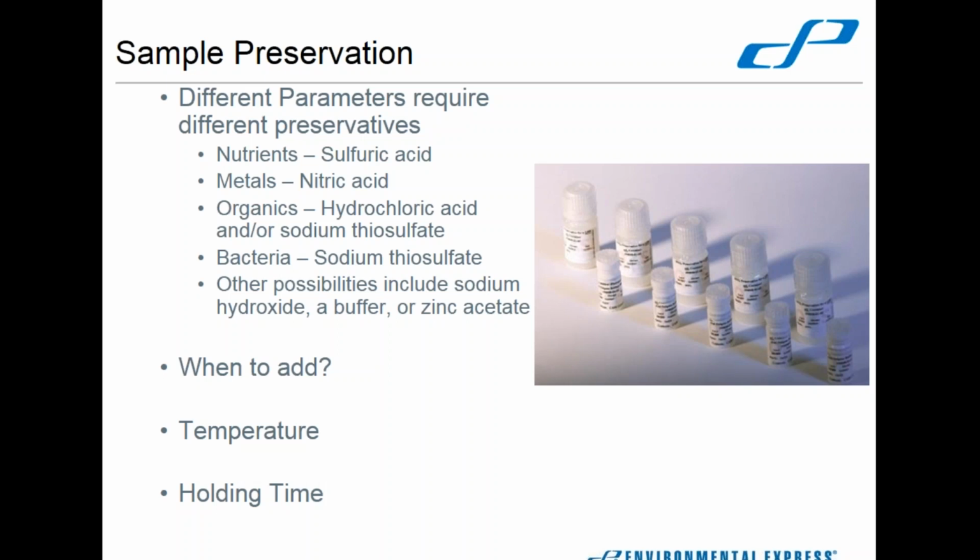There are instances where preservation can be added back at the lab or in your sample receiving area if you are within a certain amount of time. Certain samples, I believe some dissolved metals, can be filtered in the lab and then preserved with nitric acid, after which they have to sit for a certain amount of time to make sure that things get dissolved back in and are desorbed from the container wall.